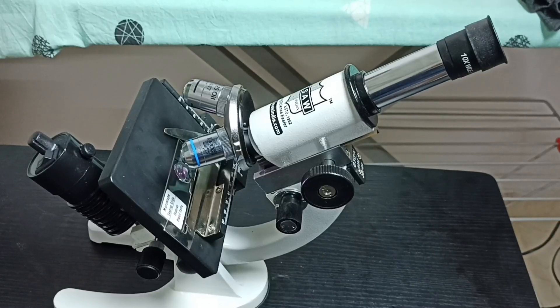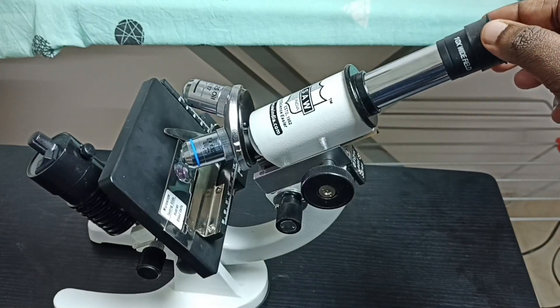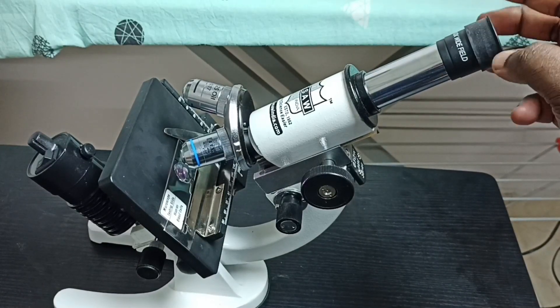Hi friends, this video shows how to clean the eyepiece lens of a microscope. This is the eyepiece lens of the microscope — let me take it outside.